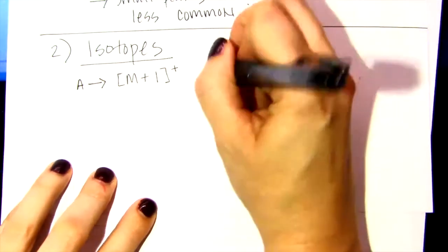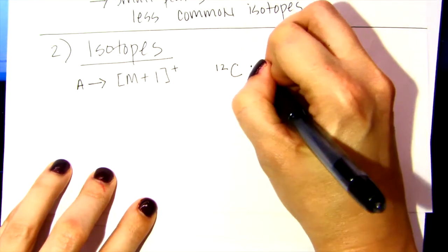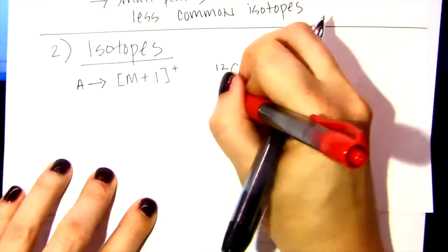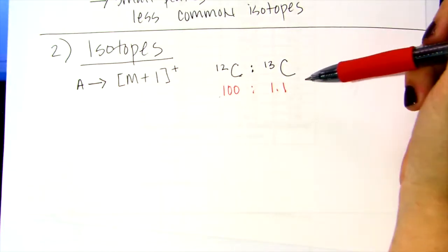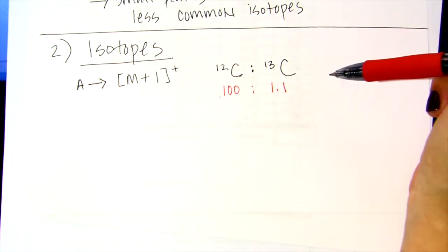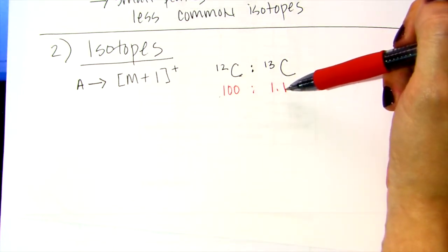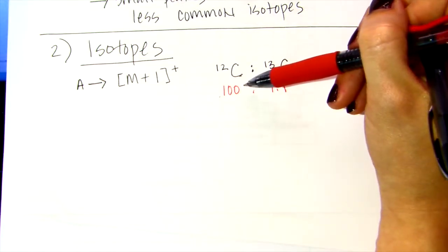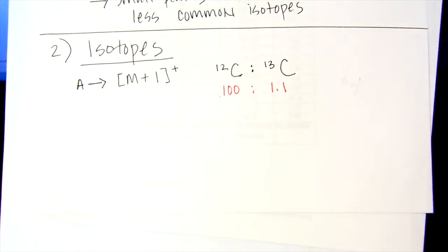So this first peak, this is where you look to get information about carbon. Because the ratio of carbon-12 to carbon-13, you're going to get a relative ratio of about 100 to 1.1. And so what you'll see is if you have one carbon in your molecule, like methanol, you would expect to see an M+1 peak where the abundance is 1.1% relative to however tall the mass peak is, right? So that's what you're looking for. And that ratio is talking about the number of carbons.